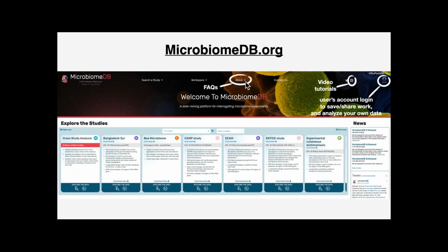The About menu at the top of the page has general information about the site, particularly how the site was designed, if you're interested in that. But I'll point you to, and we'll review these in just a minute, frequently asked questions that I think we get asked a lot. So we have answers to those FAQs under that About menu.